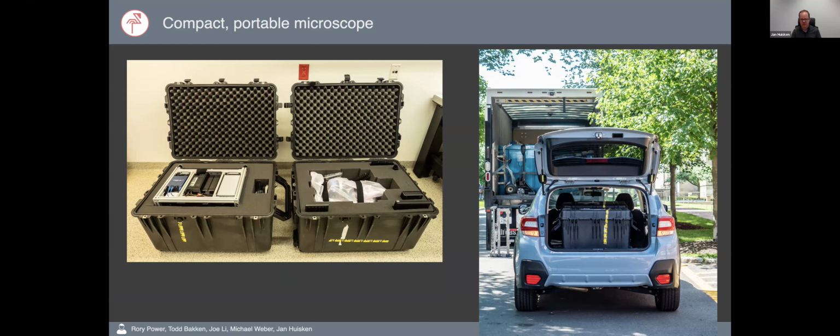And then you have this electronics unit, and that's where the lasers are in, and the laser is fiber coupled. So essentially, in order to get the beam into the microscope, all you have to do is take the fiber and plug it in, and that's really the most delicate part of this process. Otherwise, there's a bunch of cables you have to connect. And so, we have pretty clear instructions on how to do this.